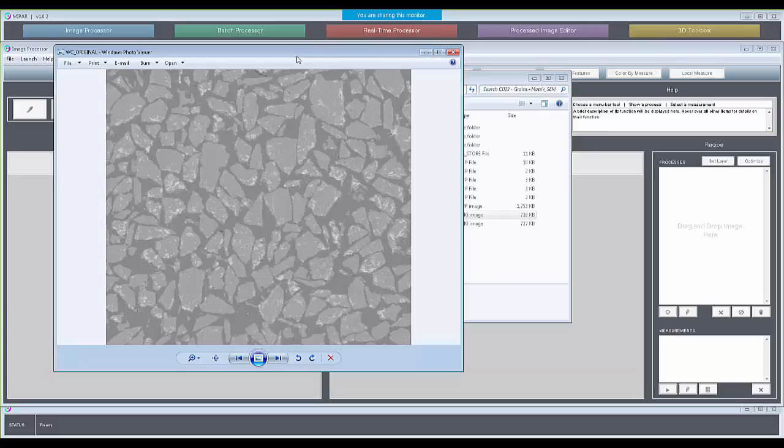It doesn't always have to be intensity contrast. You can have pattern contrast. You could have a patch of atoms that are in one structure in one area and a different structure in another, and that is contrast of some sort, and MIPAR usually can pick it up. So this could just as easily be pepperoni on a pizza or trees in an aerial photograph. As long as there's something that identifies the difference between your features of interest and everything else, we can work with it.